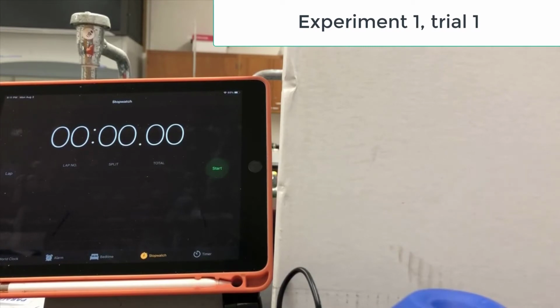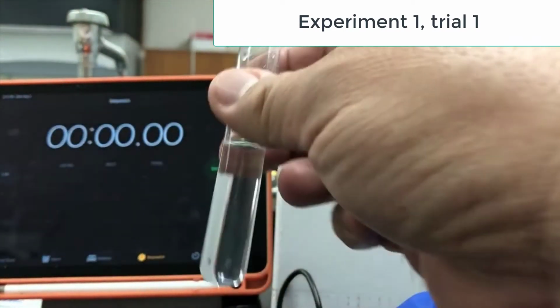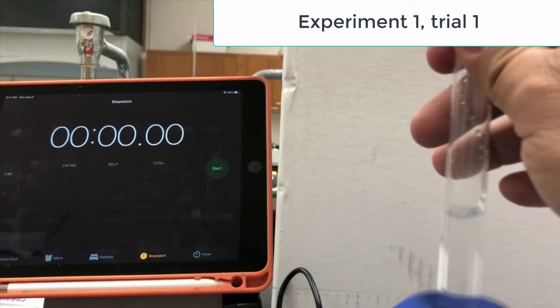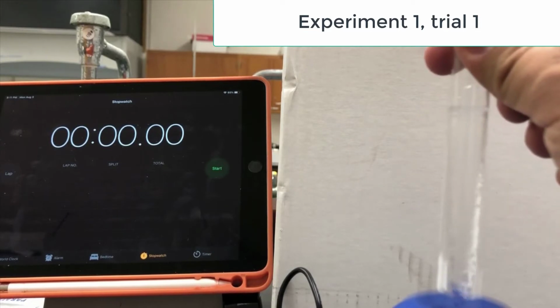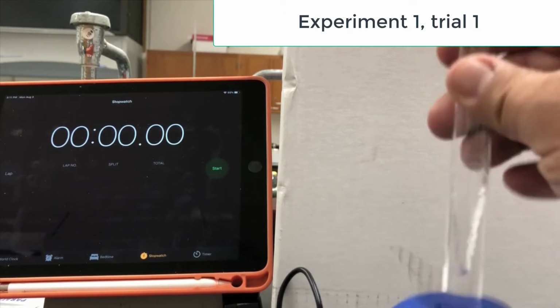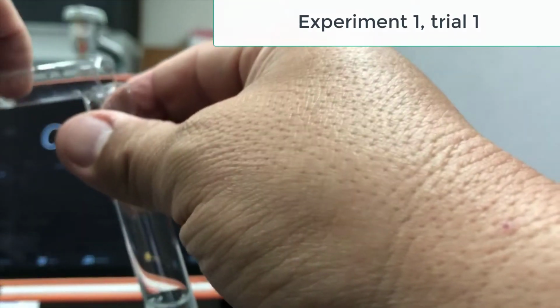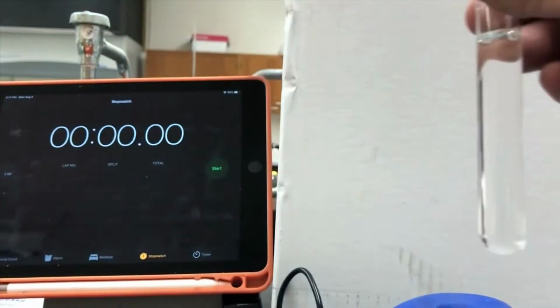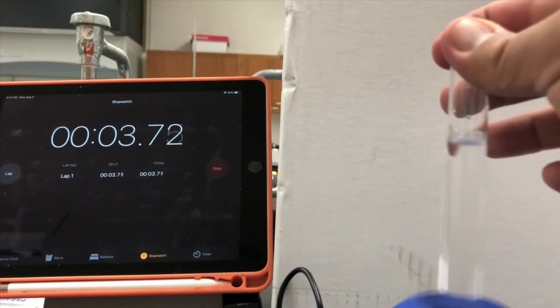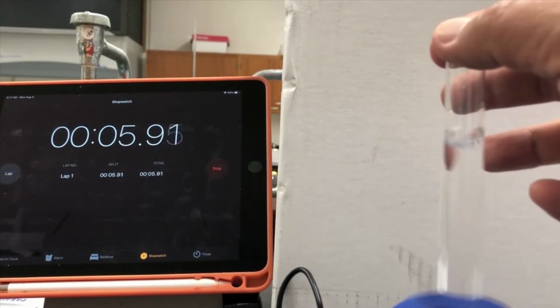So what I'm going to do is slightly different than what I said I was going to do. I'm going to go ahead and mix these together. This is the small tube and the large tube. And then I'm going to set it in here. I'm just going to vortex them together, and we'll try to watch it in the test tube while it's vortexing and see if that gives us a nice, consistent, and quick color change, okay? So this is what I'm going to do. I'm going to add this together, start this, vortex this. And we'll just watch this to see how long it takes.